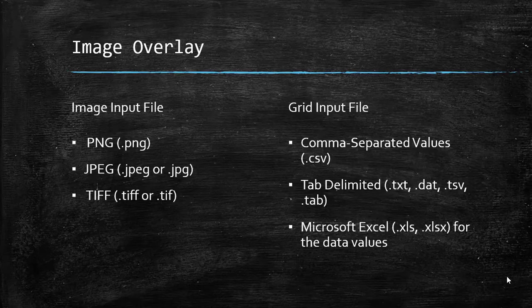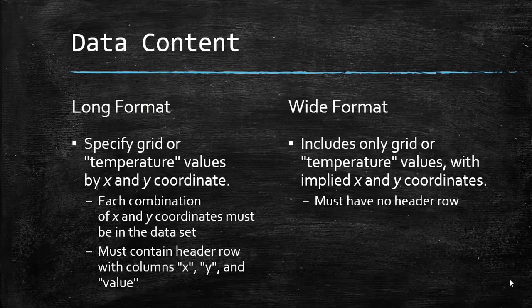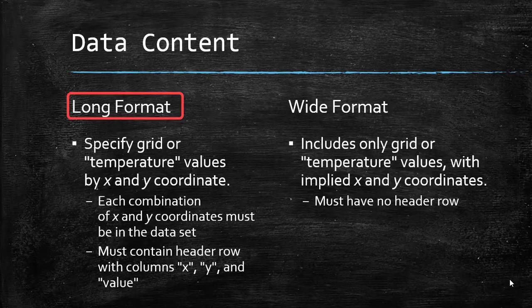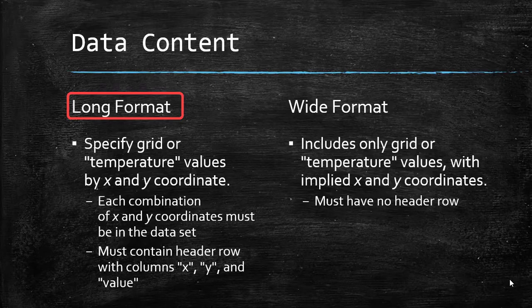There are also some specifications within the input to consider. There are two acceptable formats for the grid data in the image overlay heatmapper: long format and wide format. The long format specifies grid values by X and Y coordinates. Each combination of X and Y coordinates has to be in the dataset, and this type of input also requires a header row with columns X, Y, and value typed out.